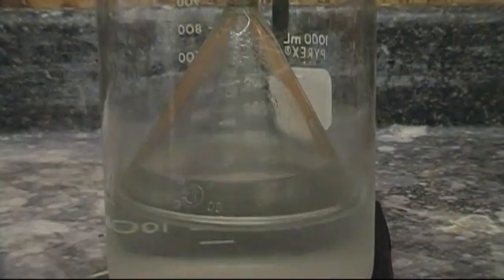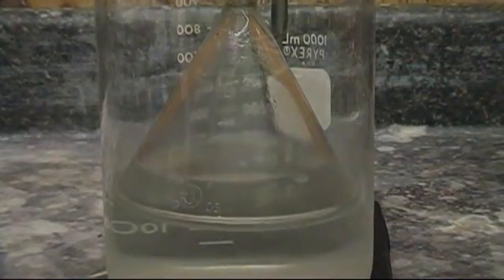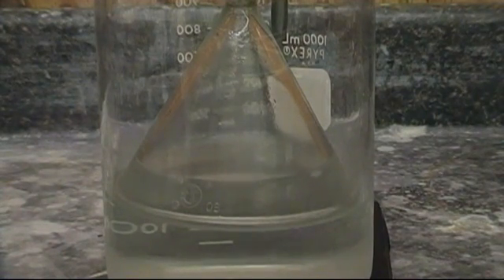Then when the reaction is done, the water gets sucked back up the funnel. Then outside air is pulled in, equalizing the pressure.